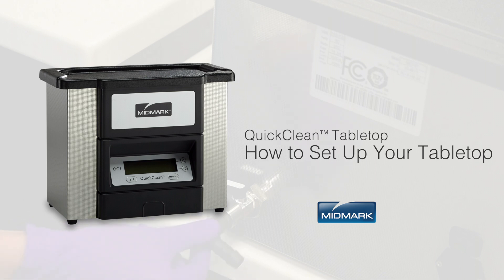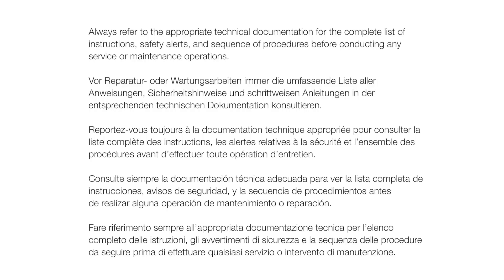This video provides an overview of how to set up your QuickClean ultrasonic cleaner. Always refer to the appropriate technical documentation for the complete list of instructions, safety alerts, and sequence of procedures before conducting any service or maintenance operations.